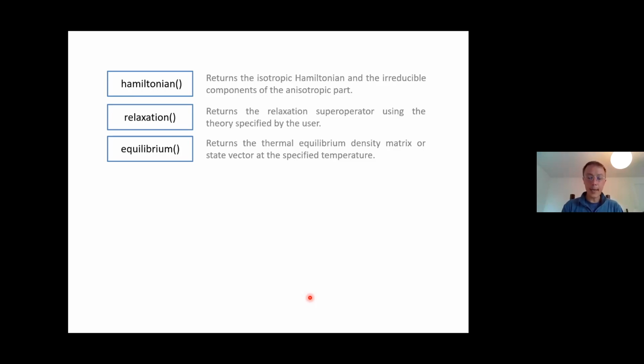On the other hand, there are hundreds of pre-programmed experiments and pulse sequences that are easy to use for somebody who is not an experienced spectroscopist and is simply modifying some example. And so there are low-level functions in SPINACH and there are high-level functions in SPINACH.